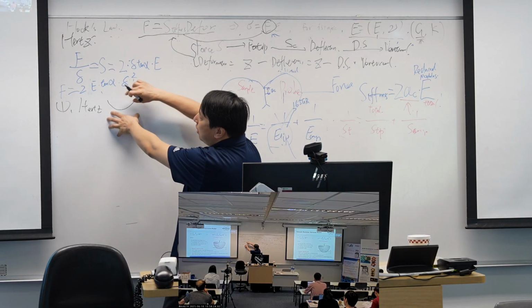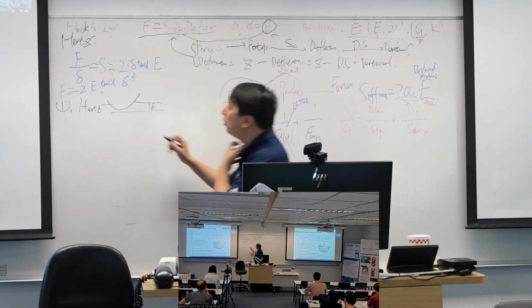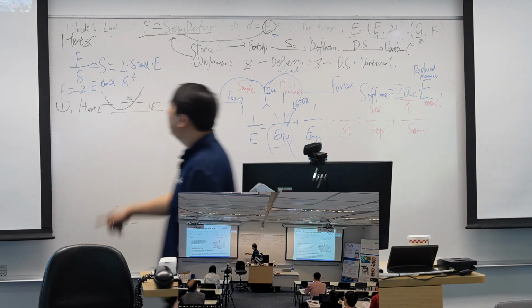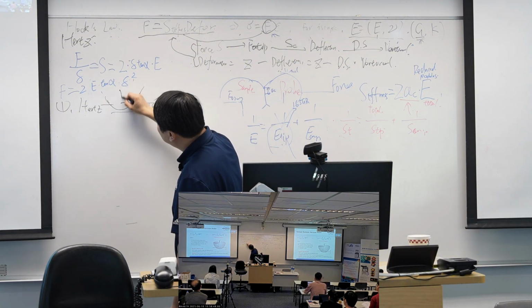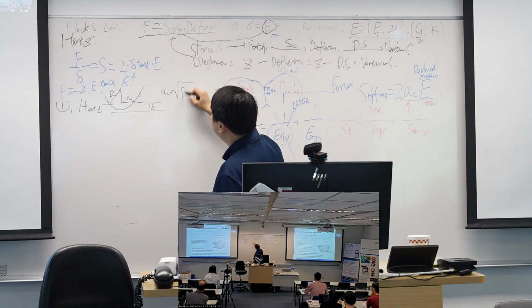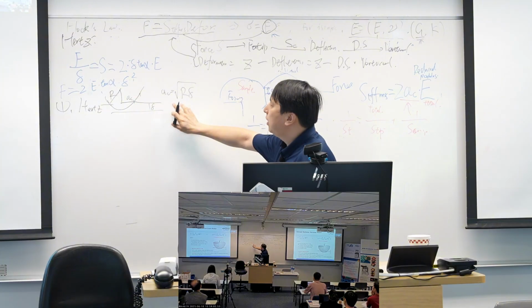So I use a sphere probe to indent my sample. I get the deformation delta. And so his idea is to calculate the a_c, the contact radius. For this one, we know the radius of our probe. So a_c just equals the square root of R delta. It's just the geometry. You can do some calculations after the class. So we have the a_c like this.